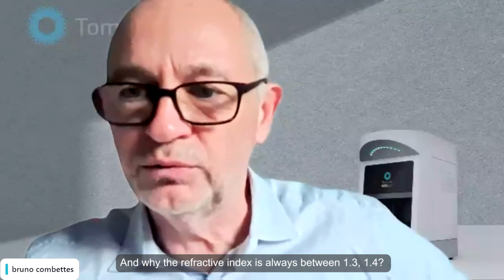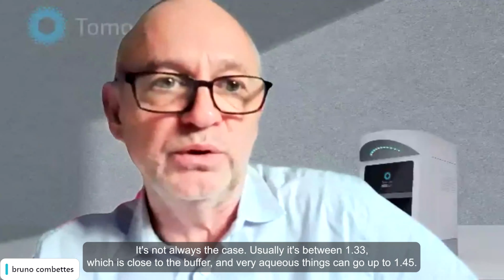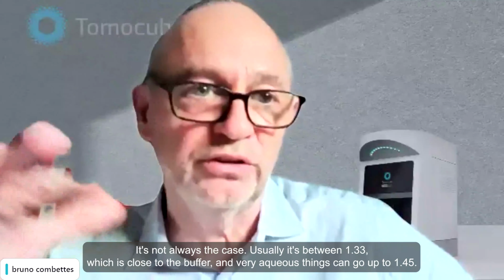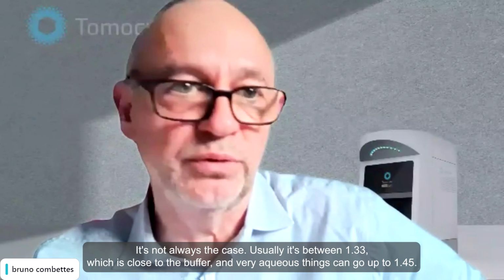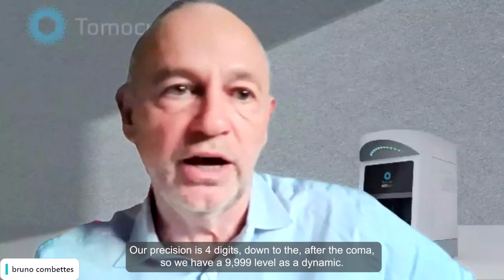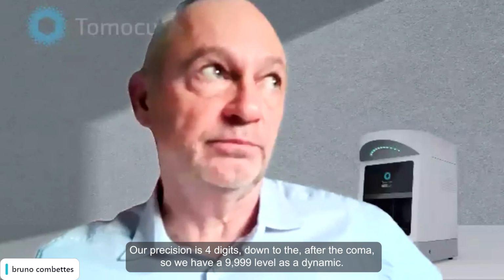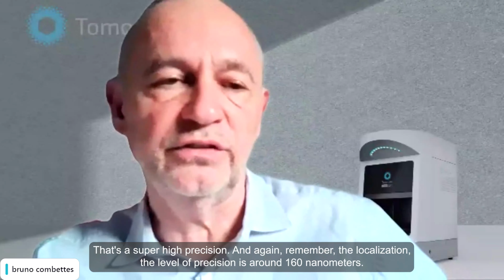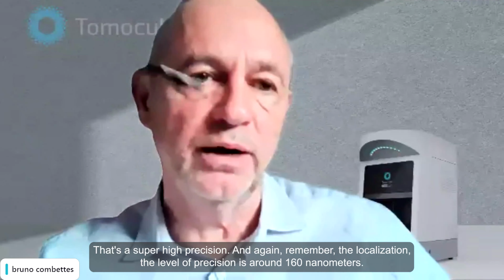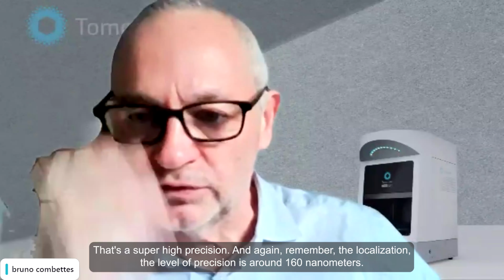This is fully compatible. And why is the refractive index always between 1.3 and 1.4? It's not always the case. Usually it's between 1.33, which is close to the buffer or very aqueous things, and it can go up to 1.45. Our precision is four digits after the decimal point. So we have a 9,999 level as a dynamic range, let's say. That's a super high precision. And again, remember the localization, the lateral precision is around 160 nanometers.